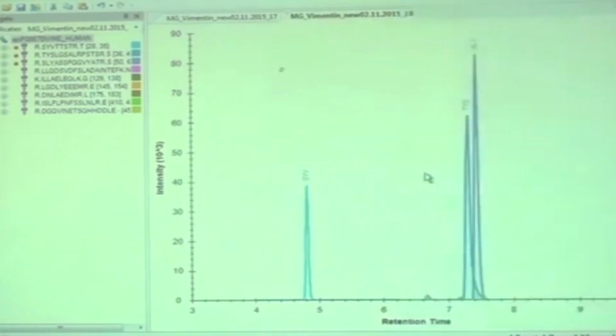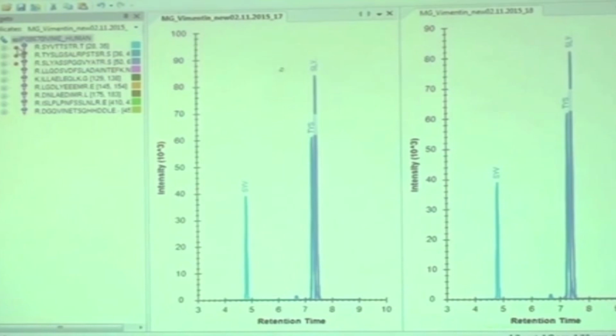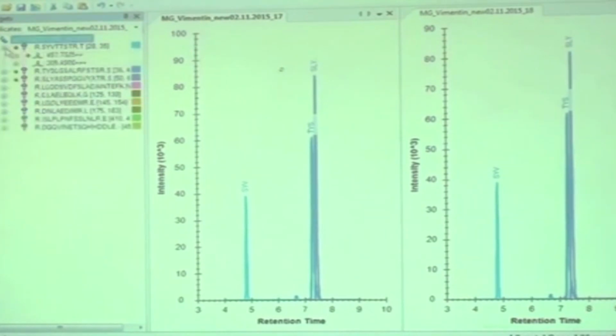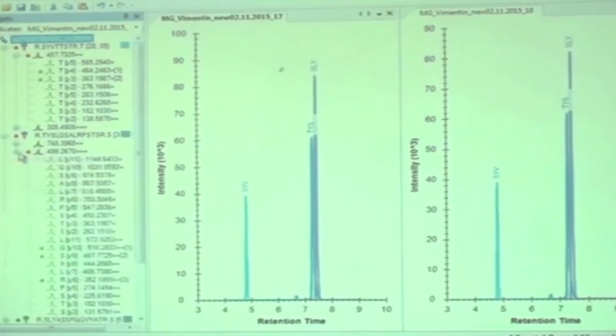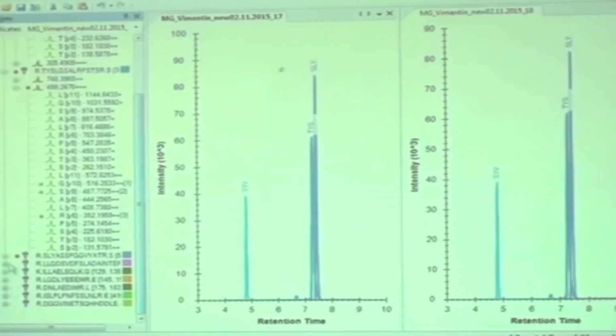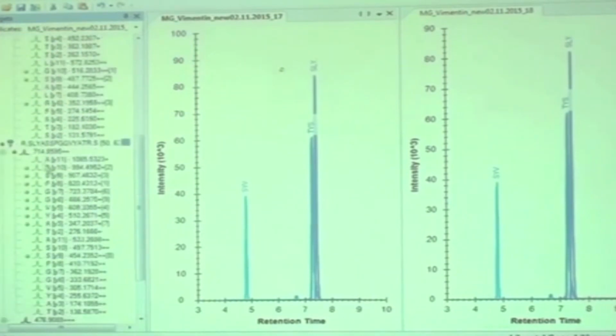So, you can just adjust the data files, and here you can see in the remaining peptides there is no response generated. Only for these 3 peptides there is response generated. But still they are looking red because for some of the transitions there will not be any response. So here only for these 2 transitions response is there, and here also for 3 transitions response is there. And in this case also there are many transitions for which response is generated.